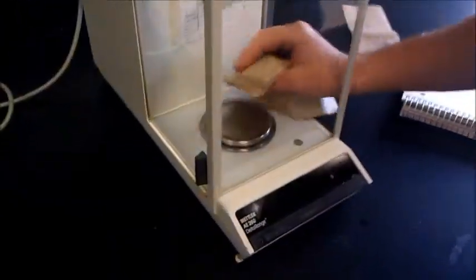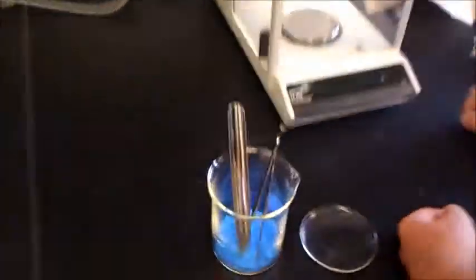And now Matt will demonstrate how to mass by difference. Before starting, the balance and the watch glass need to be cleaned. Now, you must zero the balance before measuring the watch glass.